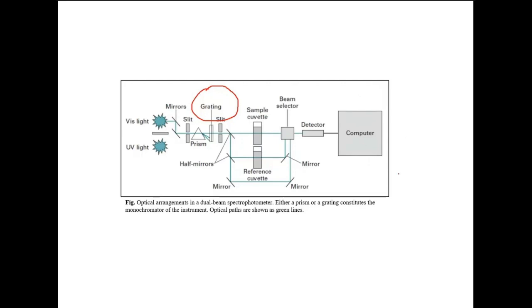So finally everything is computed now. We need not do anything, we just have to keep the sample in the best quality within the sample holder and then the reference holder. The rest of the thing will be taken care of by the computer itself.